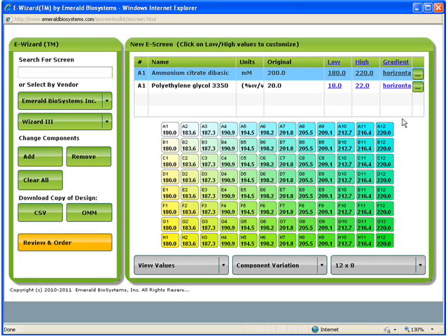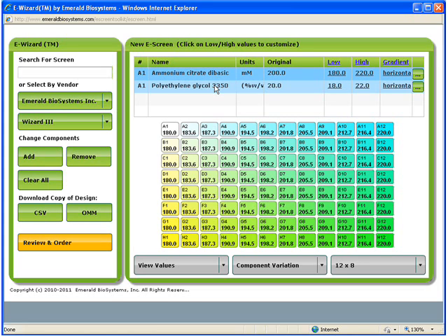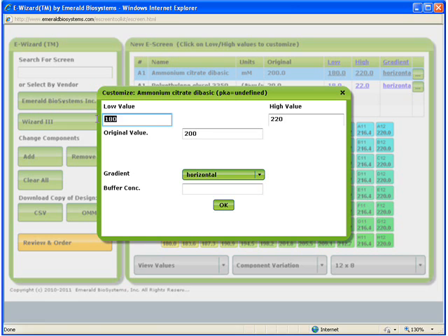Of course, you may want to edit the screen to fit your own design. Clicking on the individual components will indicate how the concentrations of those components will be varied within the screen. In this case, the default screen is varying the ammonium citrate concentration from 180 to 200 millimolar, and the PEG3350 from 18 to 22%, both varied horizontally across the screen. But I would like to change the parameters to create a larger variance, so I can double-click on the ammonium citrate line and edit the gradient so that it goes from 20 to 400 millimolar throughout the screen.